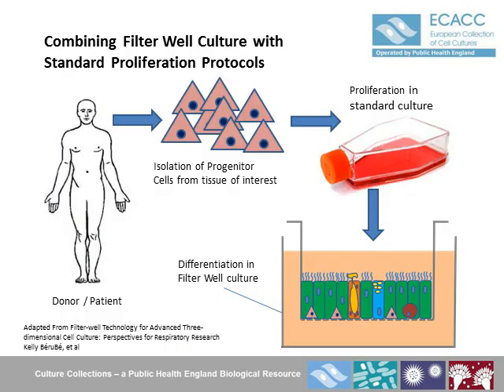Here, a pragmatic approach to the use of filter wells is demonstrated. This approach uses the advantages of conventional cell culture and the filter well technology. Progenitor cells are isolated from the patient and expanded in conventional T flasks before being plated into filter wells, and subsequently differentiated into cultures that mimic complete epithelia.